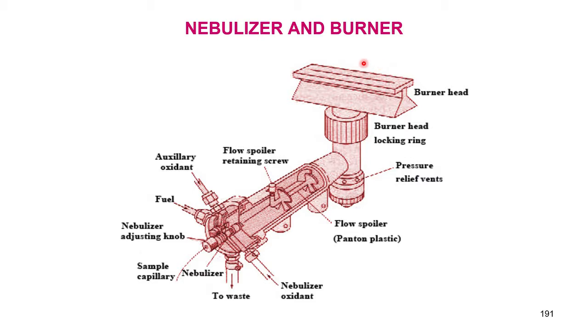Okay, follow my laser pointer. Both of them will come here, the auxiliary will come here, they will mix and then proceed through this tube. The gases will proceed through this tube into this burner, and then the spray gas will be escaping, which will be lighted here. So, this is what I had shown you earlier, how the flame will look. In the next slide it is there.